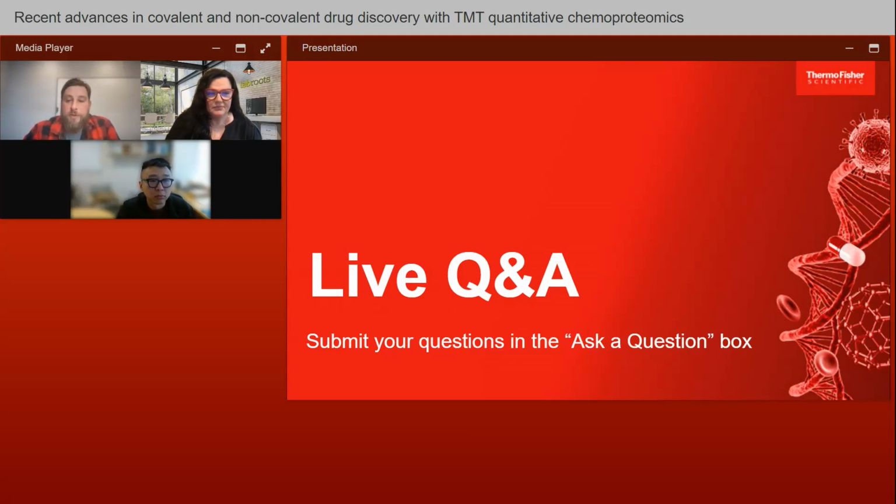Thanks for a great question. Typically, when we're talking about proteome-wide studies, when we use CETSA for target deconvolution, it happens at the later stages, or it could be done with the hits from phenotypic screens. However, in general, CETSA can be applied even for the primary screen, especially for proteins that are hard to establish a functional assay for. In this case, we can set up a high throughput CETSA assay based on fluorescence or another type of detection, and it can be used in the primary screen.